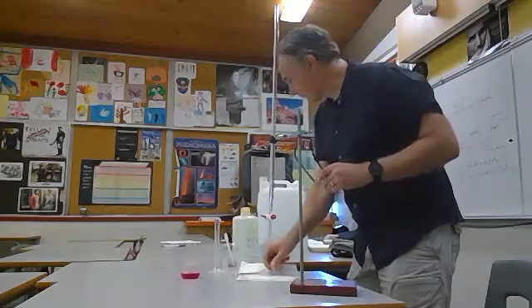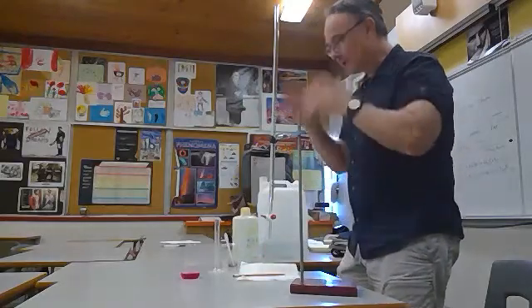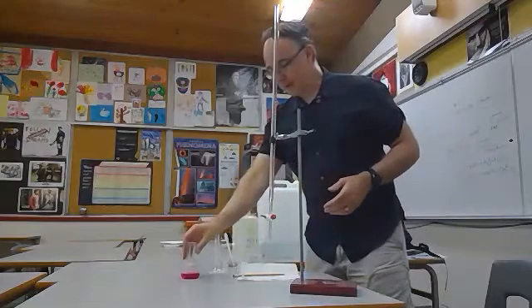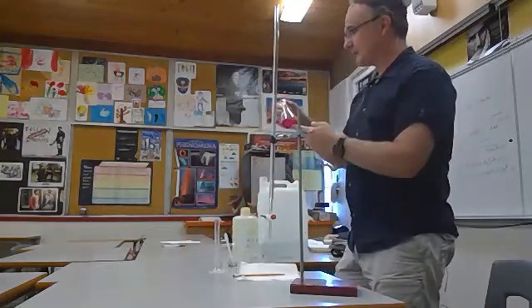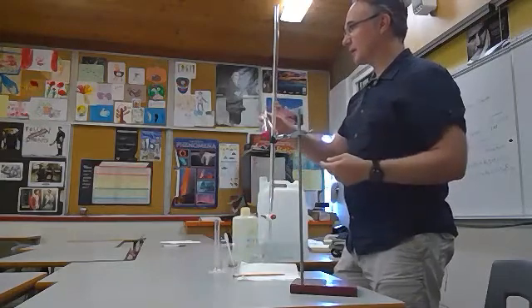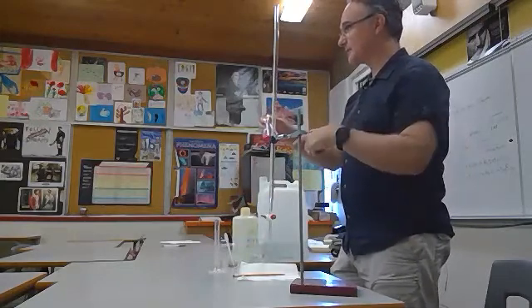And before I set this up, before you came in, I did a trial run, and I just kept adding chemical to the solution. And see how dark pink that is? That's way too dark. I've added way too much of this base.